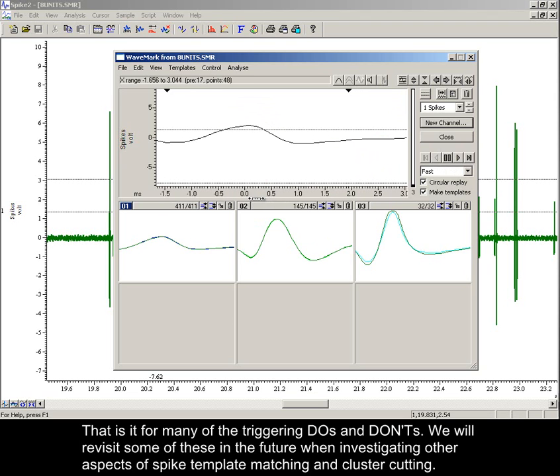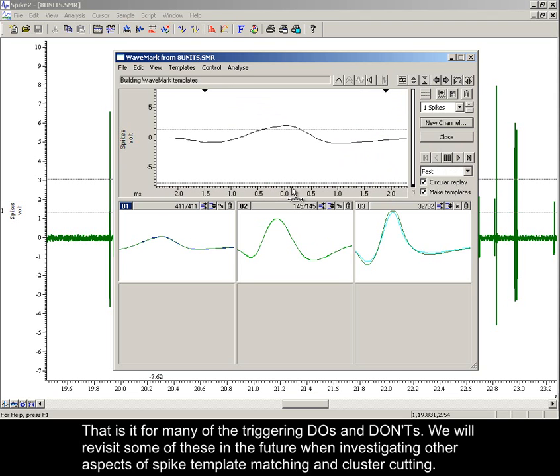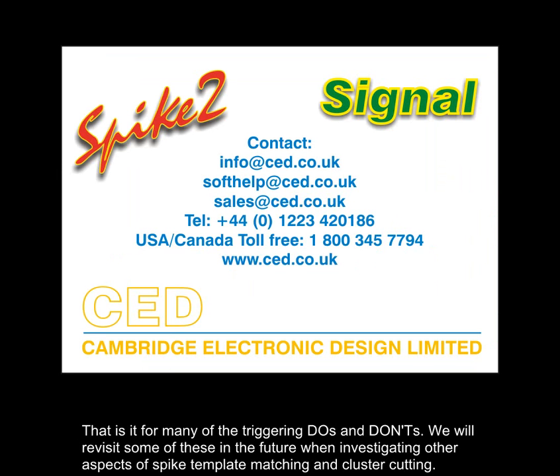That's it for many of the triggering do's and don'ts. We will revisit some of these in the future when investigating other aspects of spike template matching.